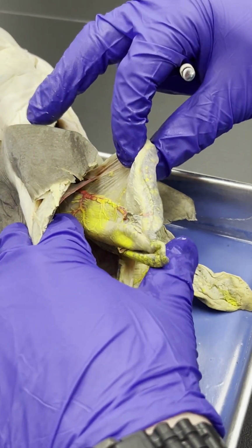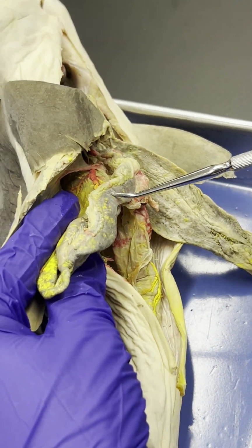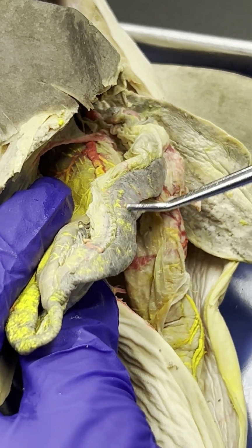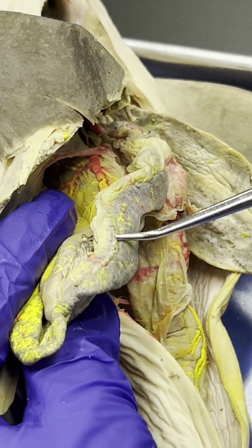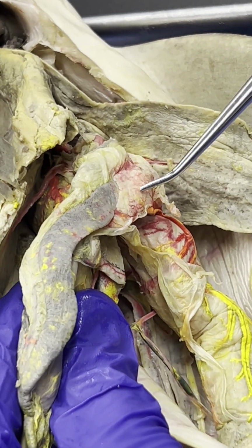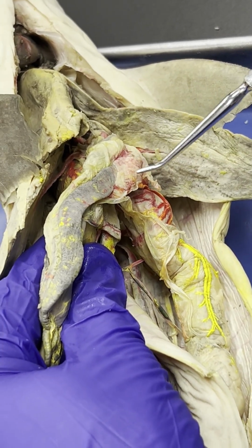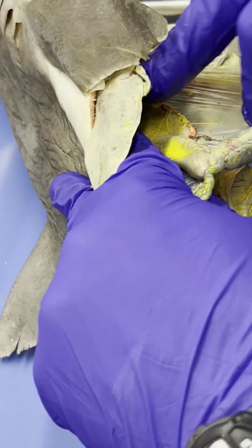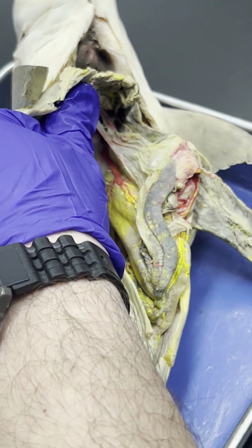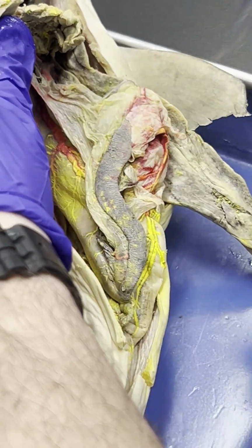And then if we kind of not flip the stomach over, but it's easier to see, this darker part next to the stomach is going to be the pancreas, but specifically the dorsal pancreas. Definitely know what the function is of a pancreas in the shark and in you. And then if we keep on going, following this down, this white section right here is the ventral pancreas, which is lighter. So here we actually have the dorsal pancreas, and then here's our ventral pancreas. It's more or less attached to the stomach, which again is right here. I don't know if the video is catching that. Stomach, pylorus, dorsal pancreas, ventral pancreas.